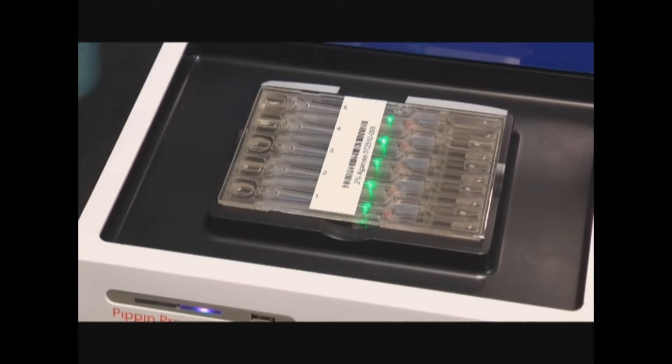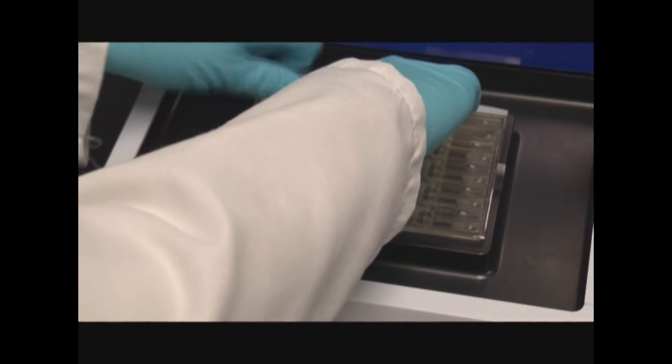Place the cassette onto the sample tray. In its correct orientation, the sample loading wells should be on the left.